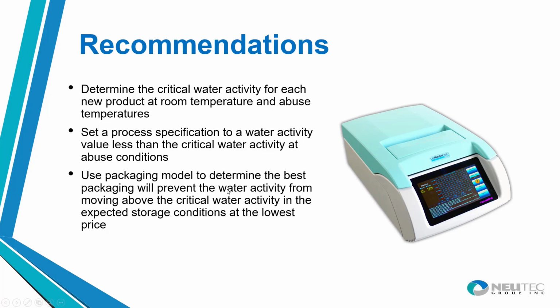And then we use the packaging model to help them determine the best packaging that would prevent the water activity from changing as it was delivered, because that's the full story. You manufacture to the correct water activity, you verify that with the water activity instrument, and then you put it in a package that's going to be an effective barrier no matter what type of abuse conditions they might encounter.